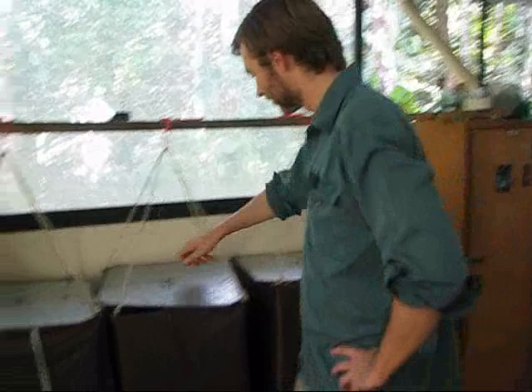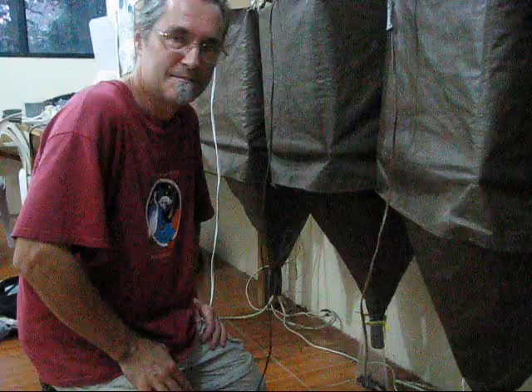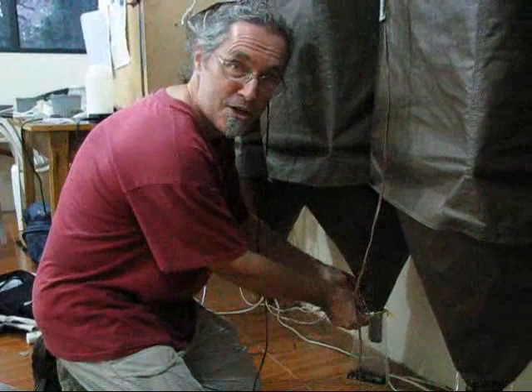Turn on the light. Wait several days. Remove your specimens and enjoy! Good luck.